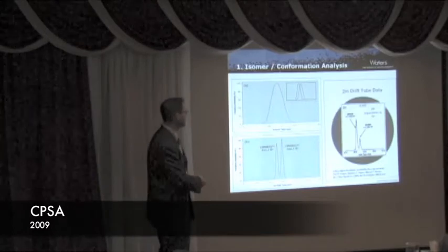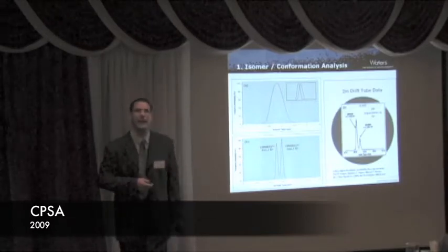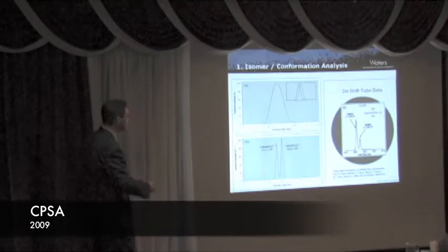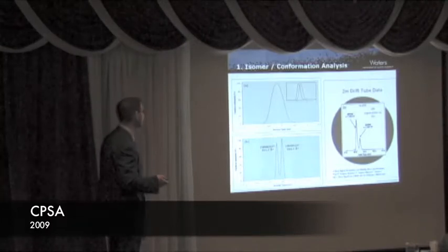And that came out at the same time as the Bowers group released a 2-meter high-performance ion mobility separator. And you can see we get the same kind of performance in this commercially available system.